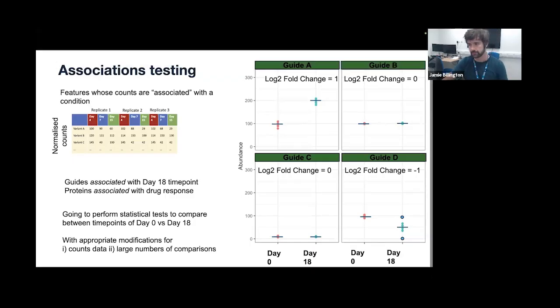To just dwell a little bit on the mechanics of this, we will be looking at changes expressed as log fold changes. So this is quite common in bioinformatics, that rather than doing linear comparisons, we do things on an exponential logarithmic scale.